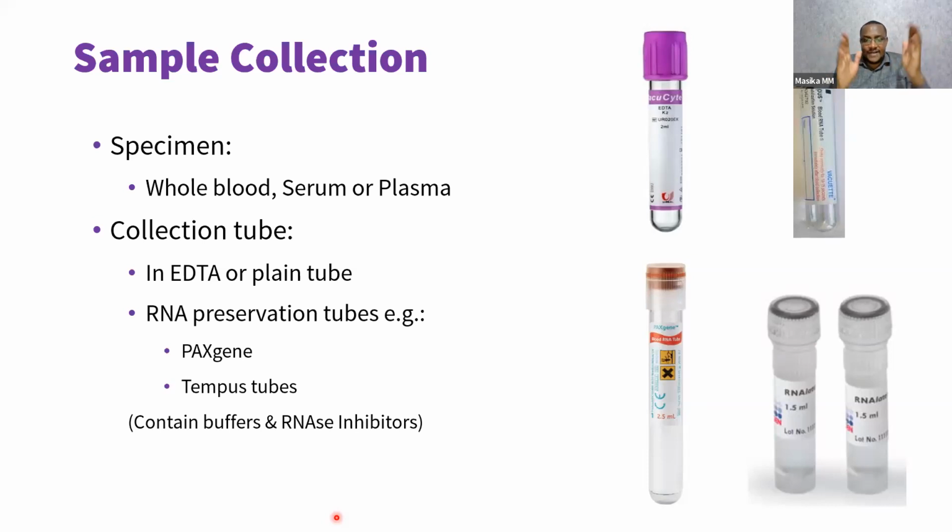And so you'll end up with a double-stranded DNA, which is only what you need. From then on, it will be amplifying that short section. But initially, in the first few steps, it will have longer segments. I didn't want to focus too much on that because some people get confused with it.